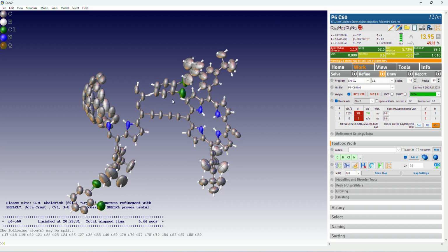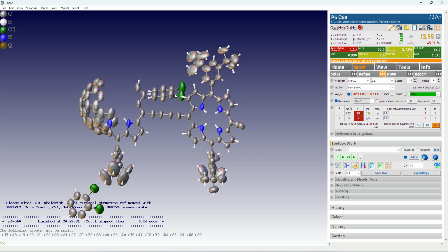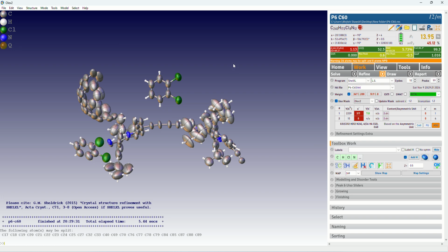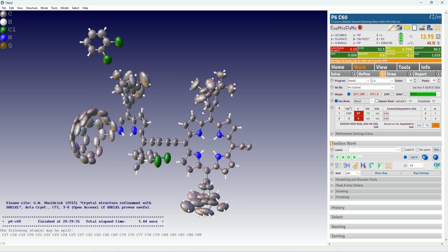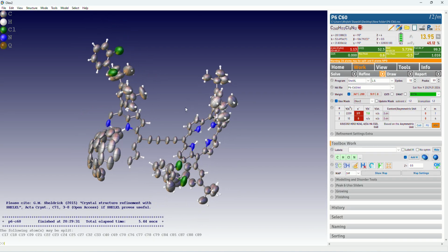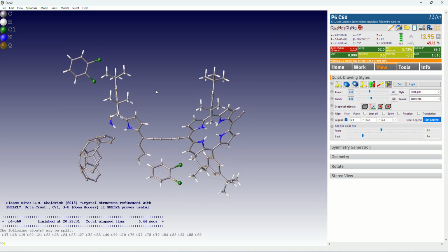And the second condition, the structure has to be chemically sensible. You cannot publish a structure which contains a benzene molecule where refinement indicated a bond length of 1.6, or where your benzene is completely boat shaped, right? So your structure has to be chemically sensible, and this structure is both fit for purpose if you are just discussing packing, and it's also chemically sensible, like everything's good.